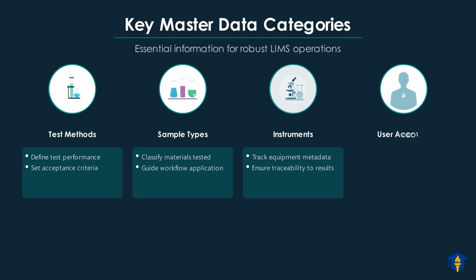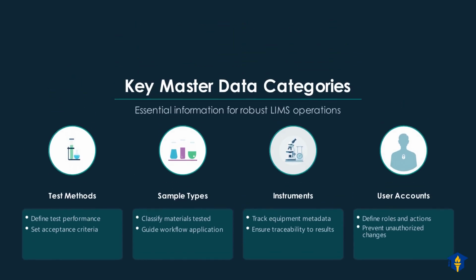User accounts are essential master data, defining who can perform specific actions. These accounts clearly define the roles and allowed actions for each user in the system. This critical control prevents unauthorized changes to sensitive laboratory data and configurations.